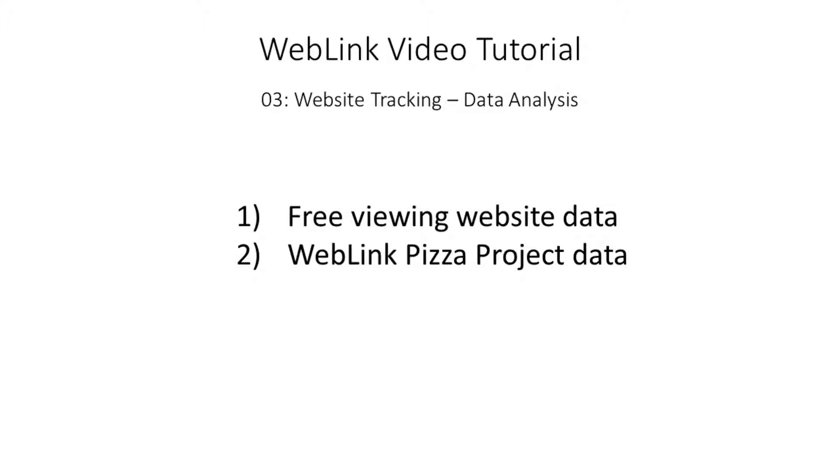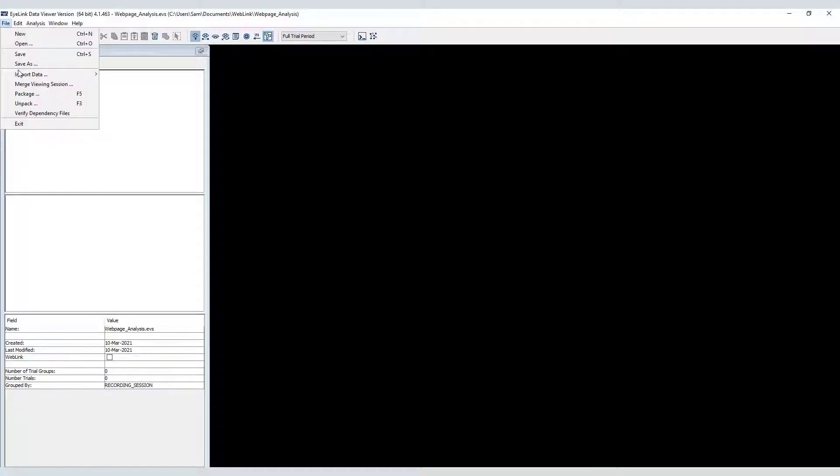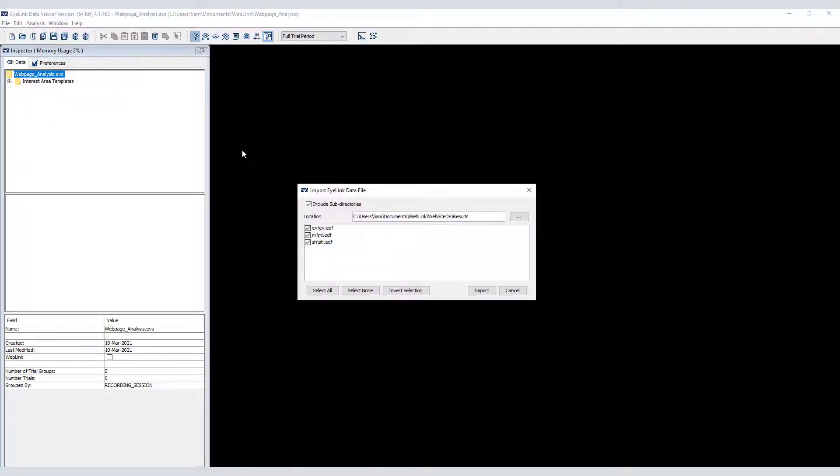I'll do that by loading in a different dataset in which three participants freely browsed a single website, the SR Research website. First we'll import the EDF files into a Data Viewer viewing session.